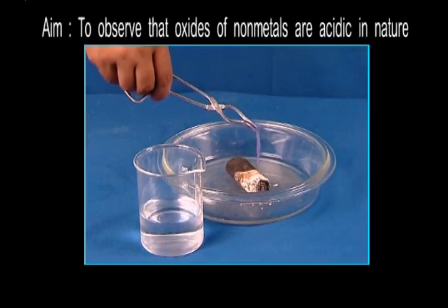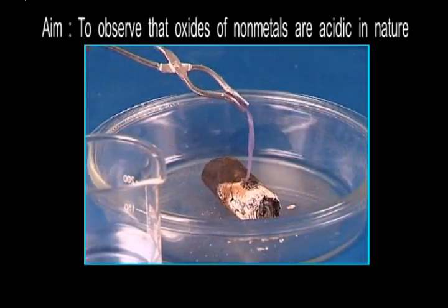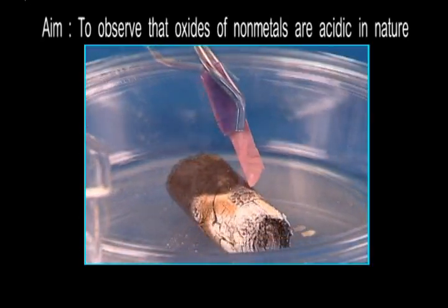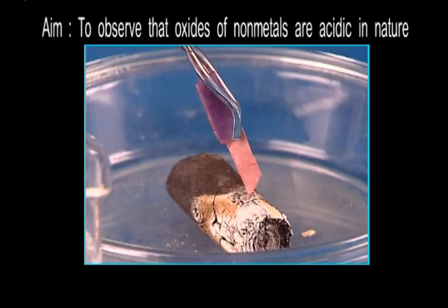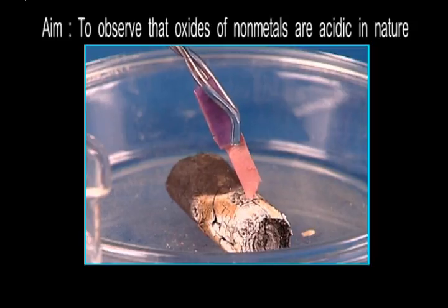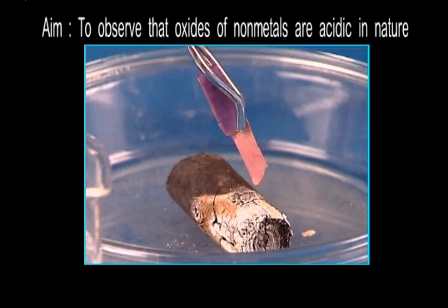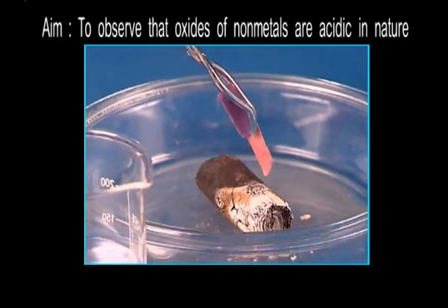We'll hold this wet paper over the smoke from the charcoal for some time. Can you see the change in the color of the litmus paper? The smoke contains an oxide of a non-metal, which on coming in contact with the wet litmus turns it red. The oxide is acidic, and when mixed with water, forms an acid.